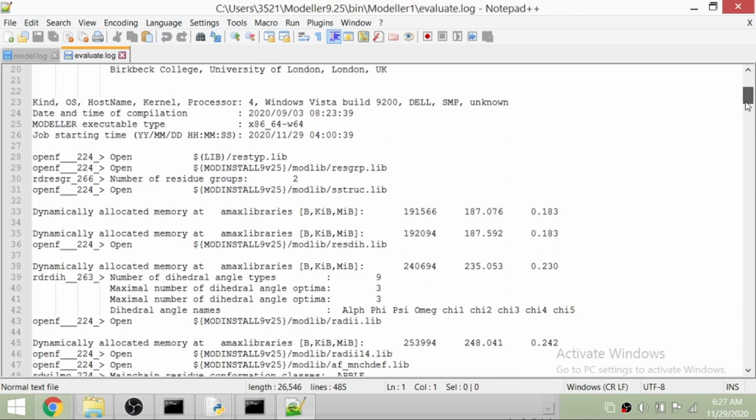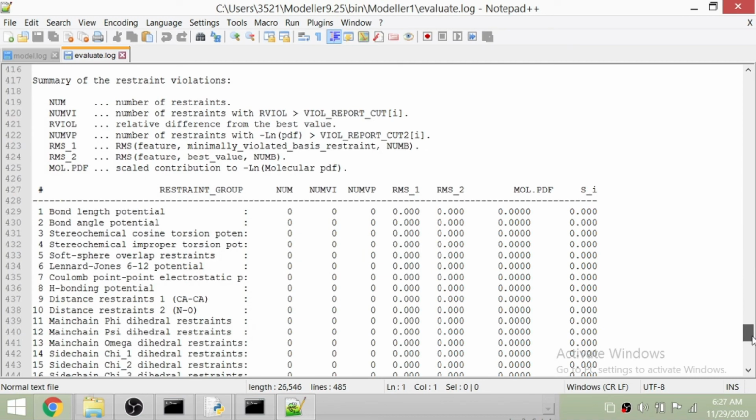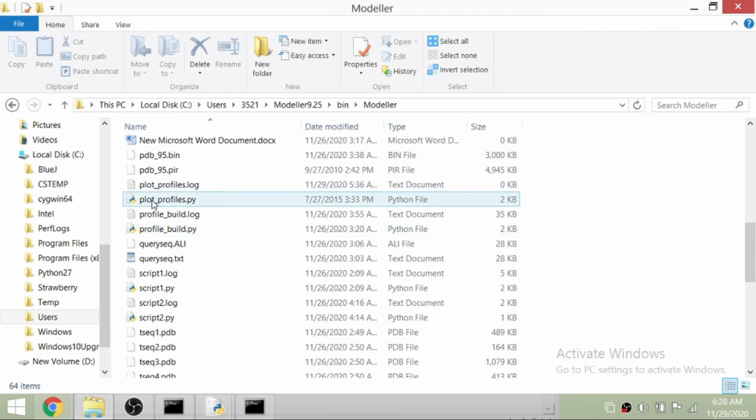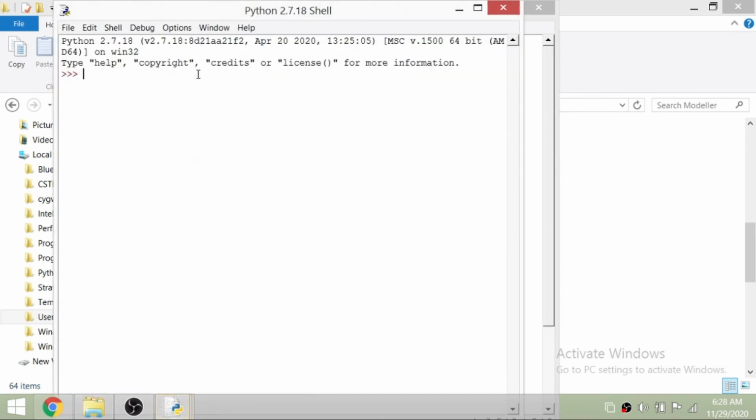the evaluation is done, and all the evaluation you can see here, all the associations and the results. I'm not going into the detail as I have said before, because this is beyond the scope of this tutorial. I'm just showing you how to run that. If you want to make the plot, we just have to run this script and insert our variables of interest, and then just run it like here. Run Python shell, and it will run the script.